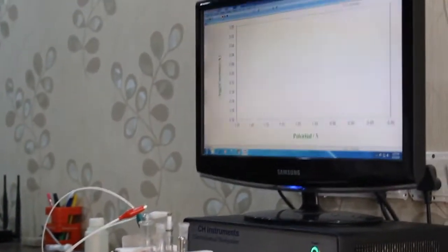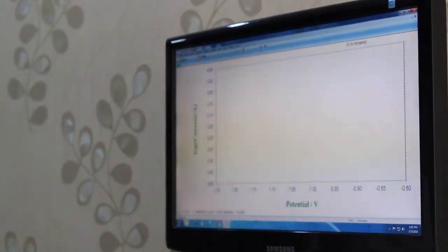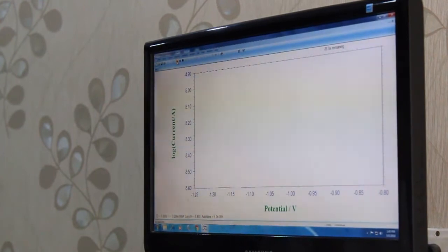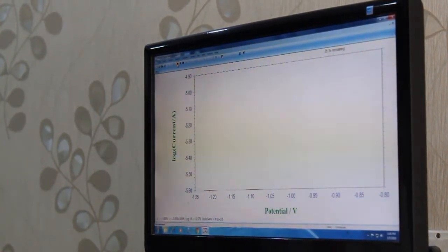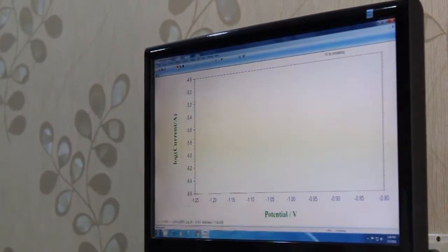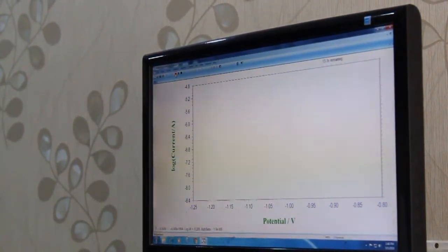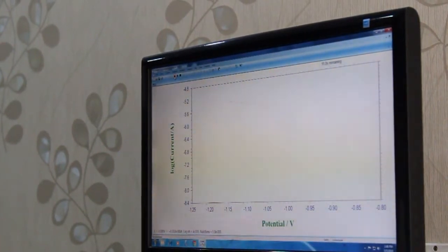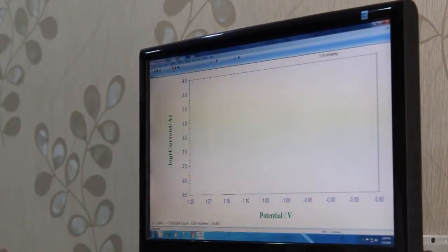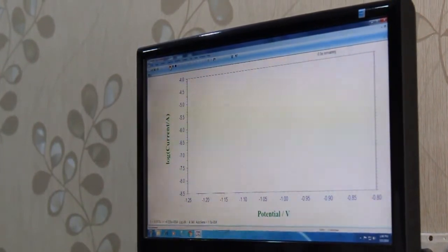Starting the experiments again. I want to make sure that there is no noise in the measurements. There is no noise seen so far, and the oxidation process is going fine. Coming back, I could see a click from the instrument, some relay changes, and after that the noise starts. There is another relay sound.